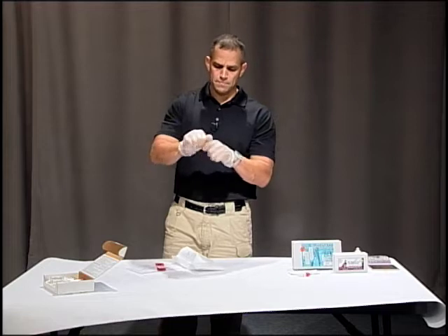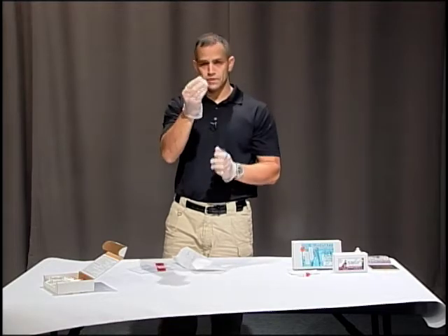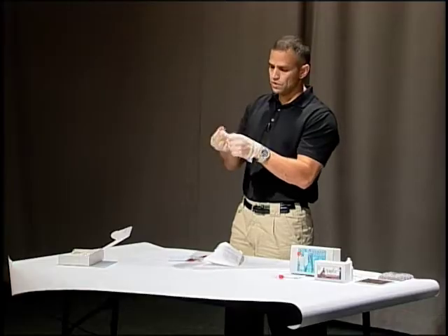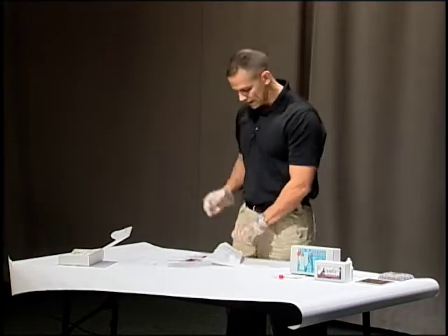We're going to do that with each one: open it up, use the plunger on the end wherever it tells you, dab that area, seal it up, and put it in the bag.